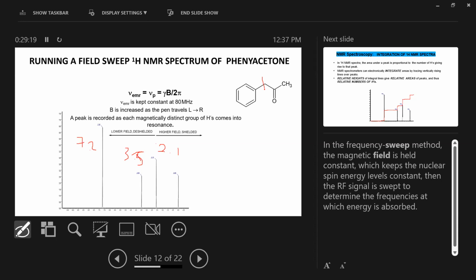Now, to be fair, there's actually a table, a list of data, showing which proton occurs where, because there are trends. They study these things, so they have to know the trends. You don't have to know it. To me, there's another way around getting the table: if you're practicing enough, eventually you just know it out of your head. For example, you know benzene is typically between 7 and 8. Benzene positions will be a bit different. Alpha protons of carbonyl typically come between 2 and 2.5. I can say this out of my head because I've been practicing long enough. Practice it long enough, expose yourself to the values long enough, and it becomes a part of you. You don't have to look back through the data sheet.